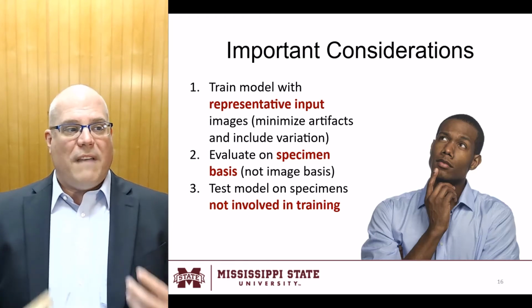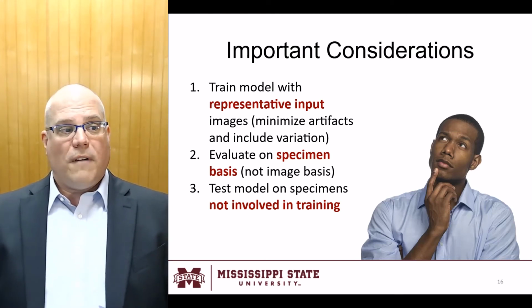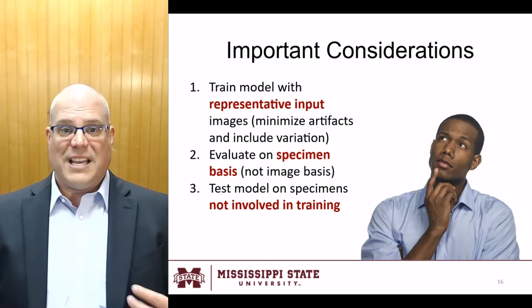We want to evaluate on a specimen basis and not on an image basis, and I'll talk more about that later in the presentation. Finally, we want to test the model on specimens not involved in the training. This is very important for generalization.